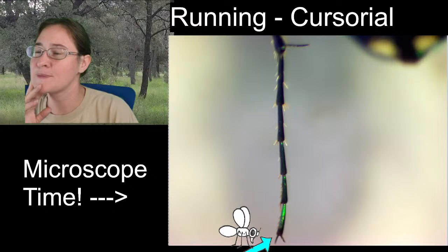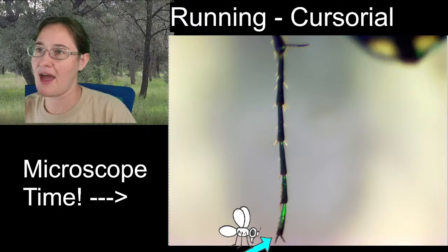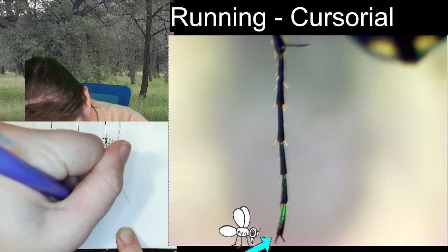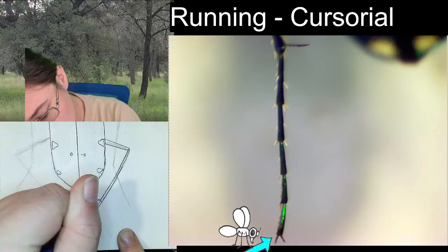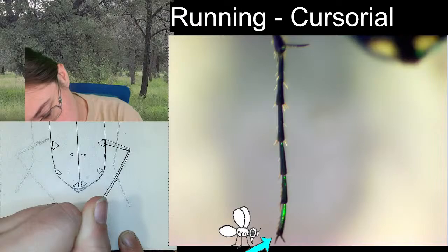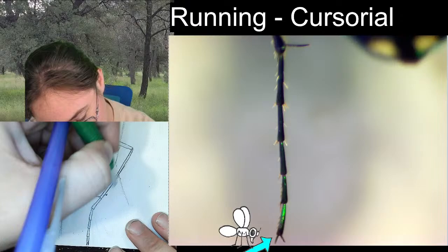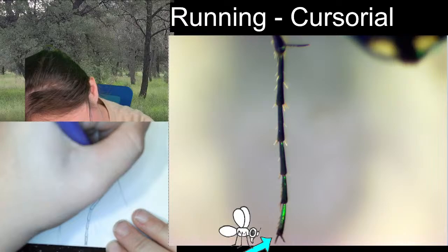And this is going to be the overall of every single one of the legs. It's going to have 5 tarsal segments, and all of those tarsal segments are long and thin. So let's see. This first one is kind of like this. 1, 2, 3, 4, 5. And the tarsal claws. That got really close to the end of the paper, but we made it. Alright, so we've got our femur, our tibia, and our tarsal claws.